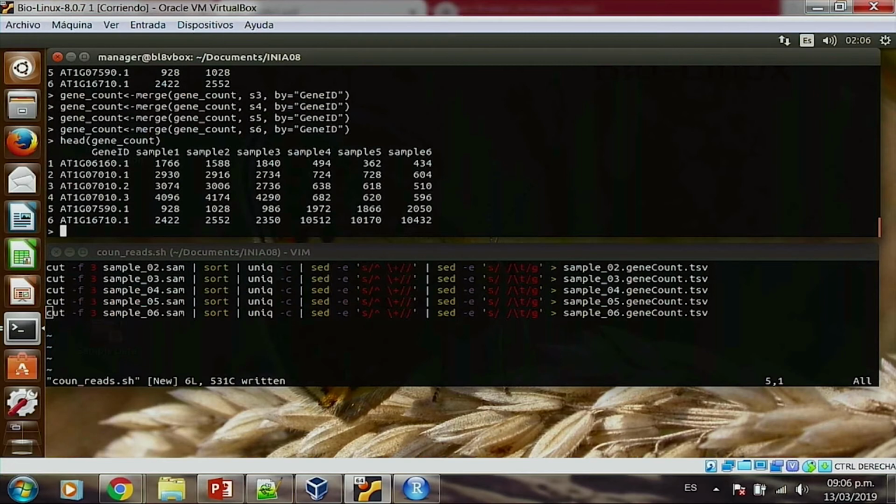It's not deleting anything. As you can see, each sample has been added sequentially. Internally, what it's doing is creating a temporary copy, which is going to be your new copy. Then you're using the current copy to duplicate and generate the whole thing. This temporary copy will have all the new information, and you're deleting the old copy and moving this temporary copy into the new copy. That's what it's doing internally.